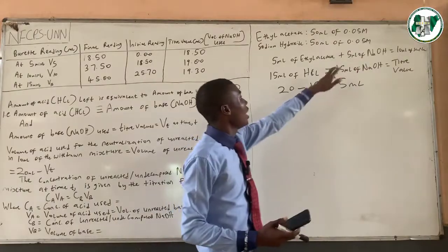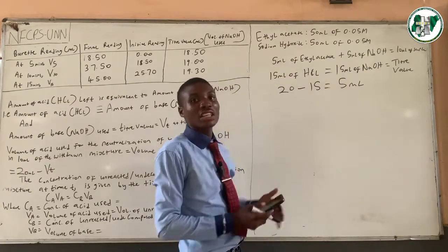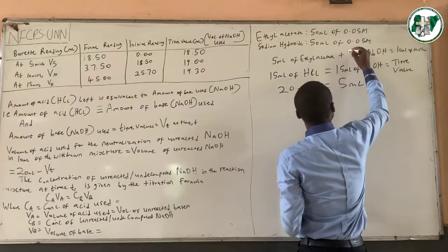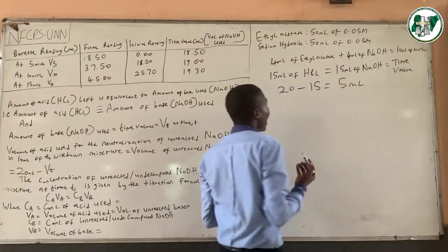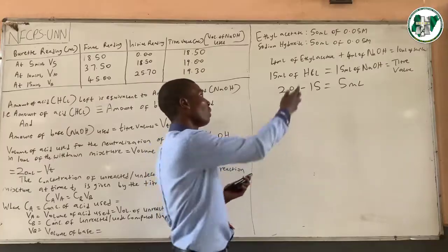In the same way, if we have 4 ml left and then we add 20 ml of acid, if it is 4 ml of this that is left, and 4 ml of this that is left, it means that the other things we are having are the sodium acetate and the ethanol, that's the byproduct, to make it up to 10 ml.